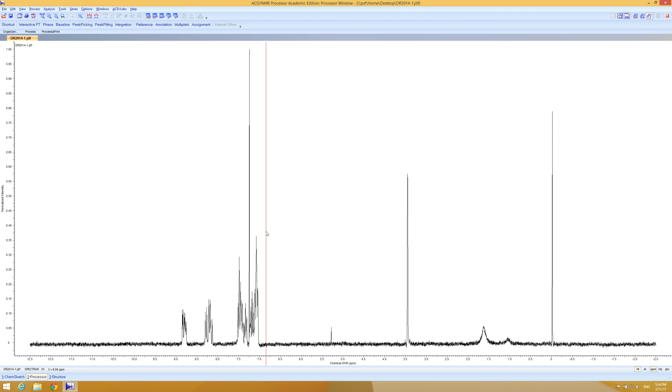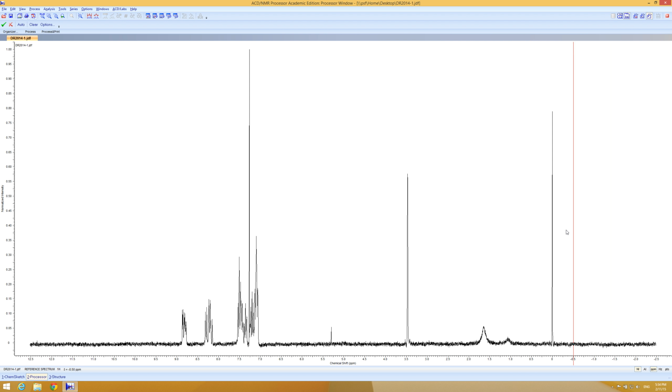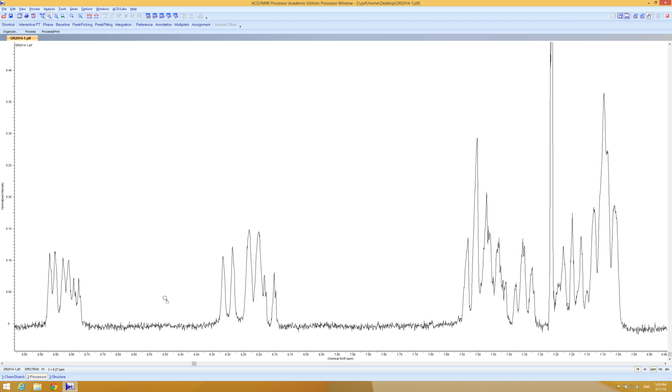All right. So since we're going to focus on 7 and 9, we need to first reference. So you get a reference, and since we're already out here, we're going to reference this guy, TMS. It needs to be at 0, so you come over here and you just scroll down and look for TMS. Make sure you click TMS 0, and that basically moves everything so that now it's all set and right. Okay, green check mark is good, and we're going to zoom in. You can pick one of these rectangular zoom boxes. Click on this guy. Zoom in here. There you go.